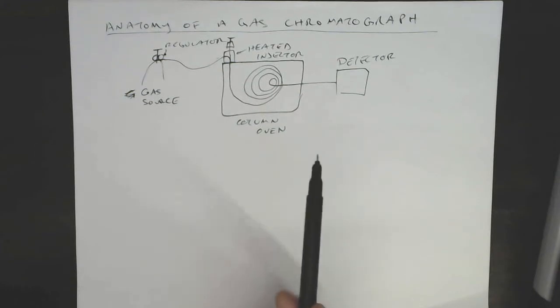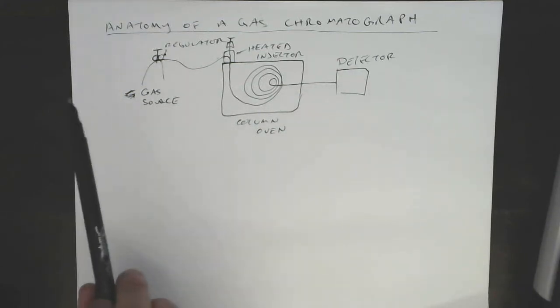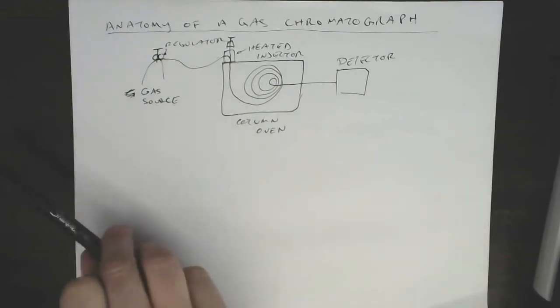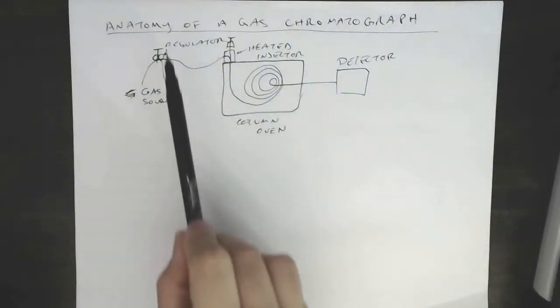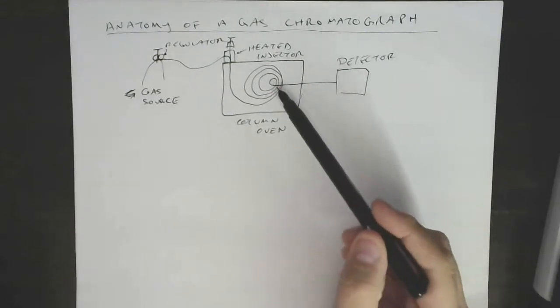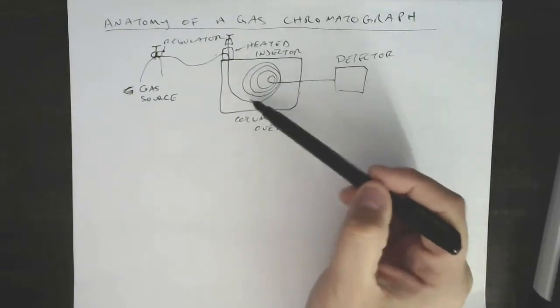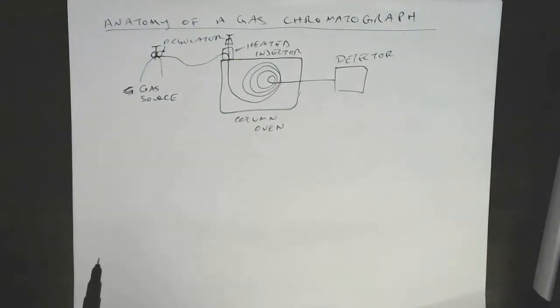Okay, so when we were doing LC, we had a diagram like this, and we went from input to output. We went through all the different parts, and then we came back and said, hey, here's the chemistry inside the column, the modes of LC. We've just finished up a discussion of chemistry inside the GC column, so we're sort of doing this backwards. We started in here, now we're going to go back, we're going to go input to output.